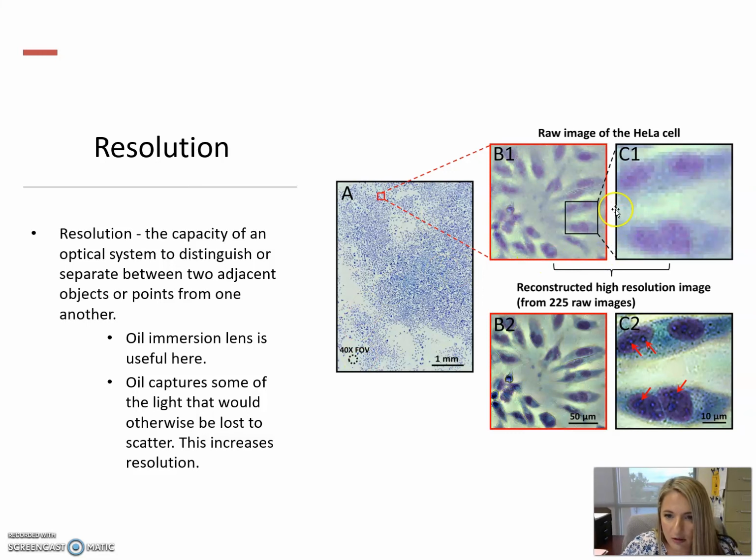And we can kind of see good versus bad resolution here in this image. So we have bad resolution up here. We can see individual structures, but you can see they're quite blurry. Down here, we've achieved resolution, so we can see them magnified, and then we can also see them clearly and see the separate, distinct structures.